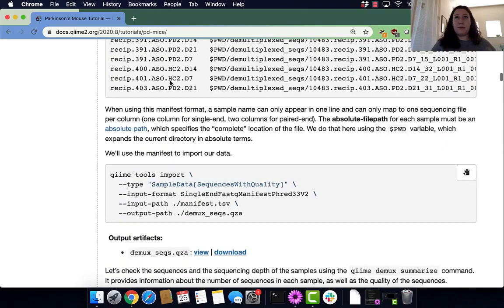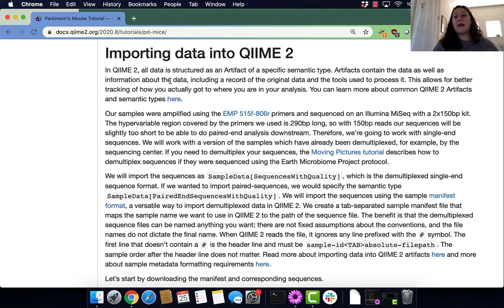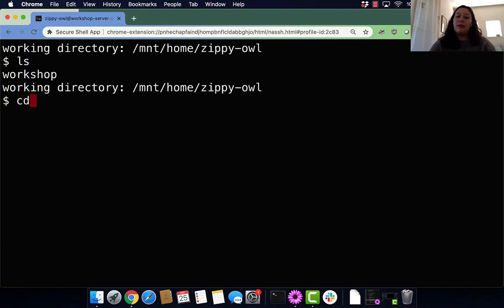The data we have for the PD Mouse tutorial is already demultiplexed, so we don't have to demultiplex this data, but we are still going to run qiime demux summarize to view our data. Before we get into that, I want to talk about where we are in our directories just to make sure we are all on the same page.